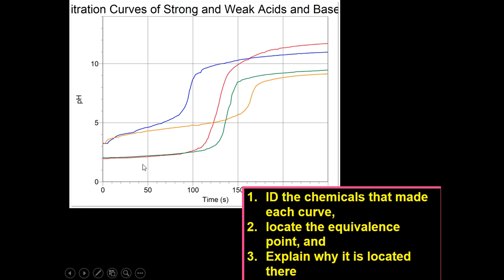So if we look at them, we can see down here, we'll start with this one here. You can see that on that one, right, we'll zoom up there. We got a weak acid. We can tell because, of course, it's starting at a pH that's closer to 7. It's in like the 3-ish category to 4-ish category. And then what I did to it was I added a strong base. That strong base was sodium hydroxide. So I got a weak quarterback. He throws the proton and then grabs it back. And I got a really strong base, which can grab any proton that's available.